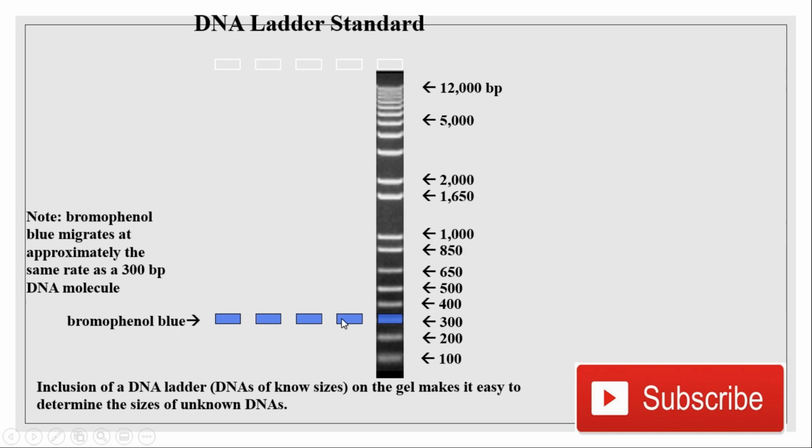In most cases DNA has the higher size, so it will appear in this range, and the PCR product will appear in the 400 to 500 base pair range. It depends upon the primer that you select specifically for the organism or species that you are using to identify.